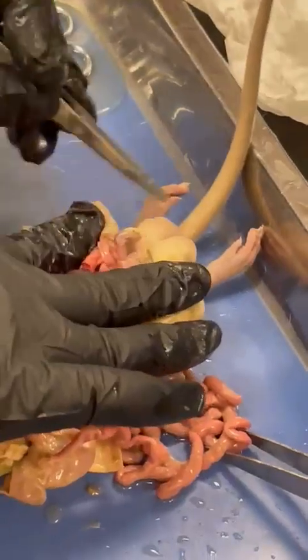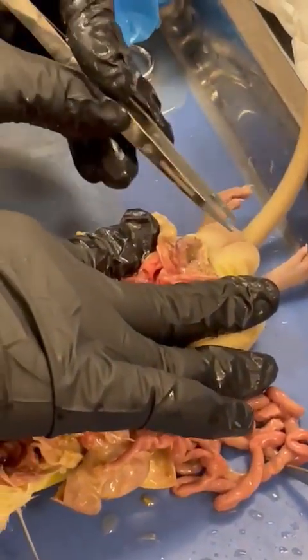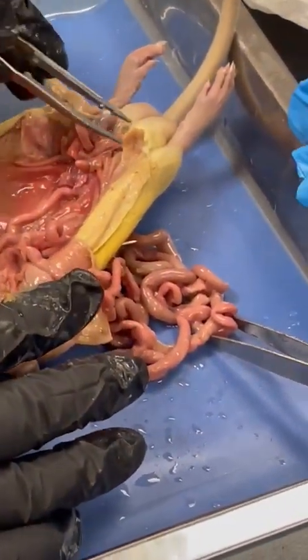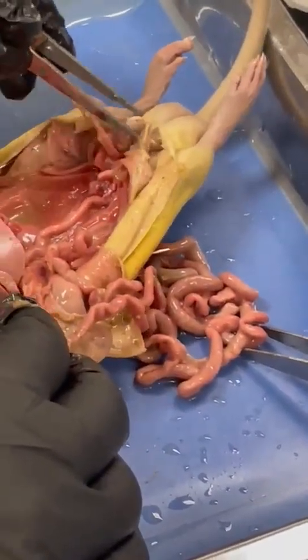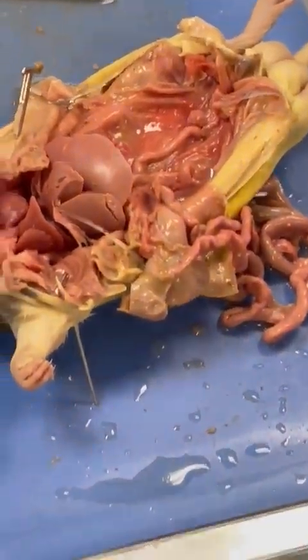And then you can open this scrotum. The testes will be inside, and the vas deferens. This is the penis. Open that and look; this is the seminal vesicle. Open that and maybe I'll come back.